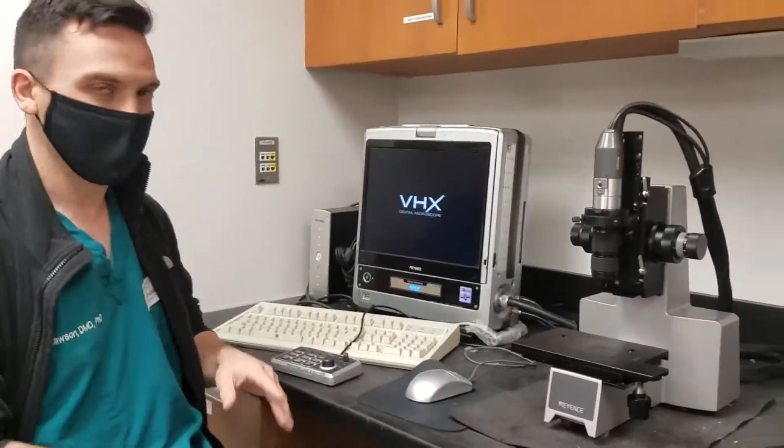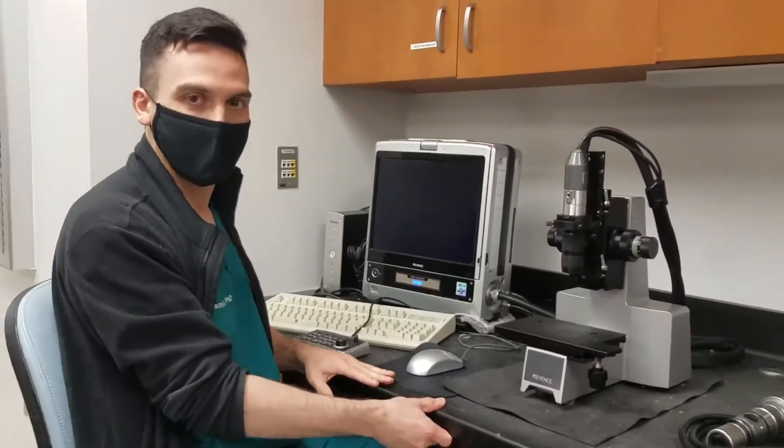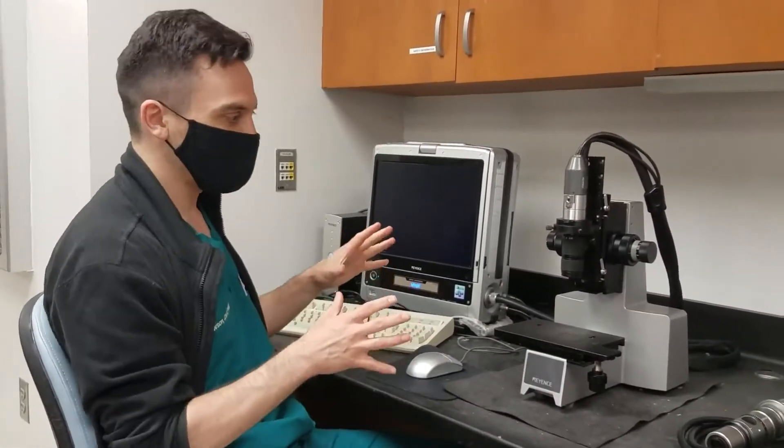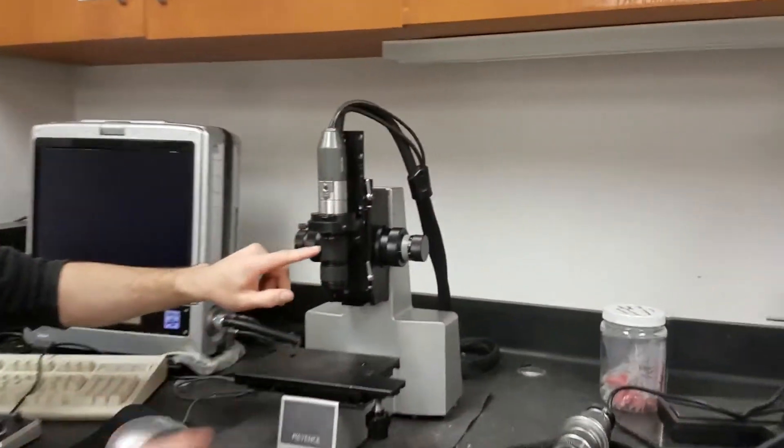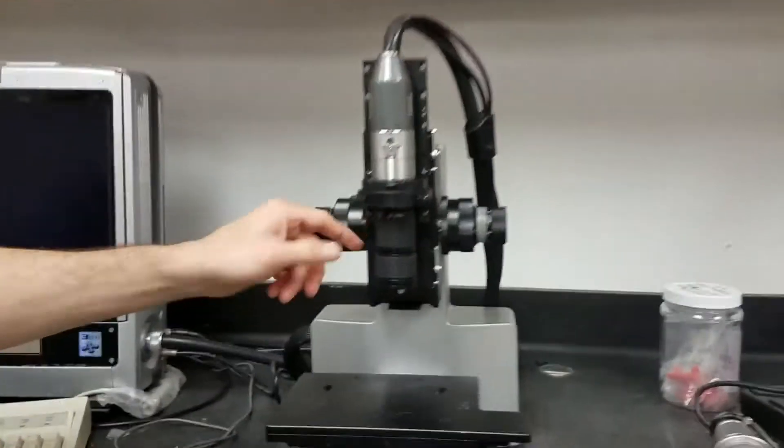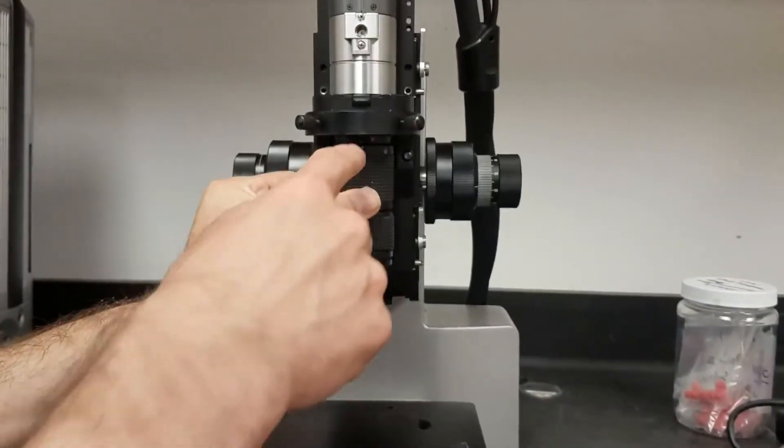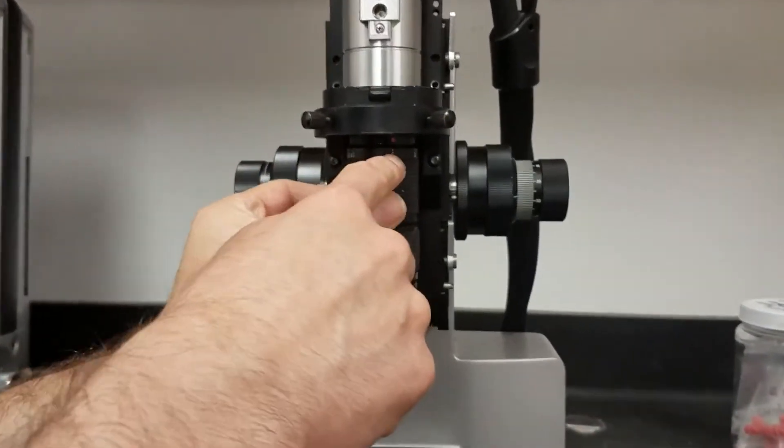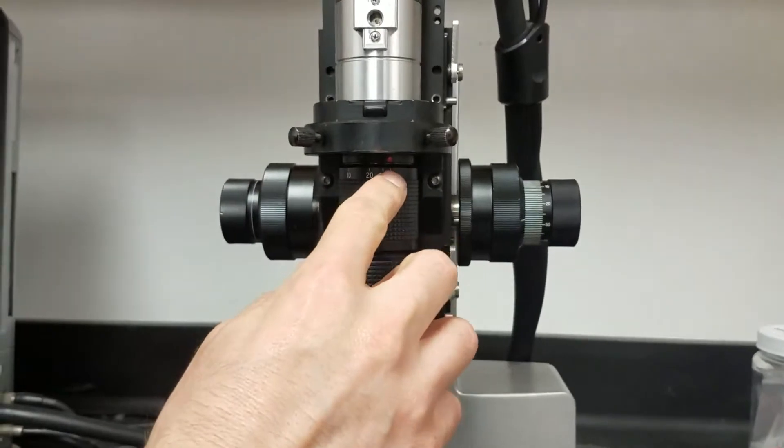Again, it's a digital light microscope. There are two different lenses you can use with this microscope. There's the one that's on here right now, and this one goes between a magnification of 5 all the way up to 40. So this is the low magnification lens.